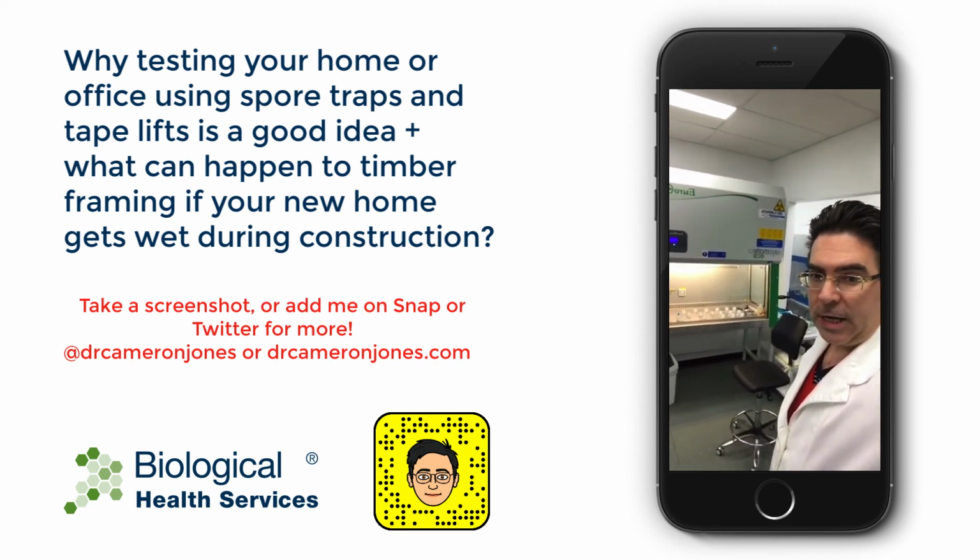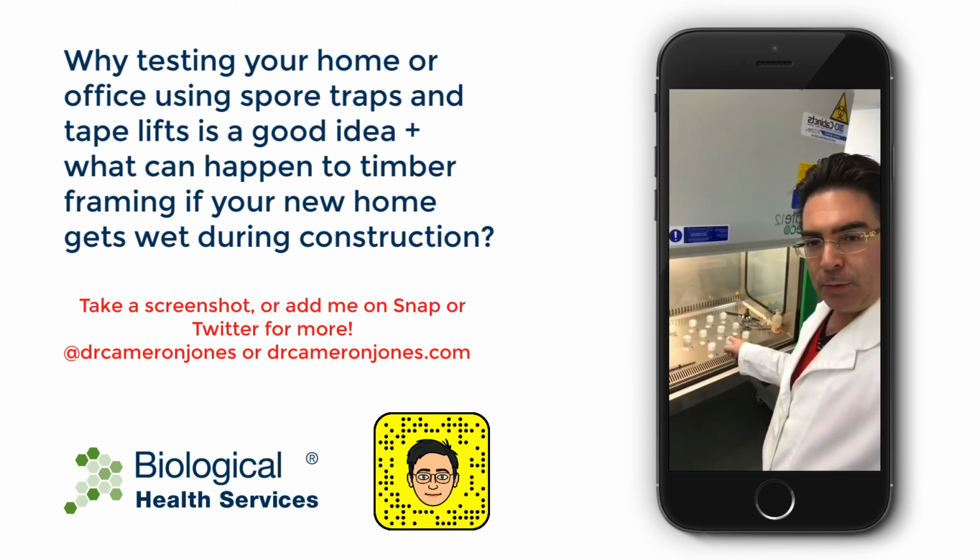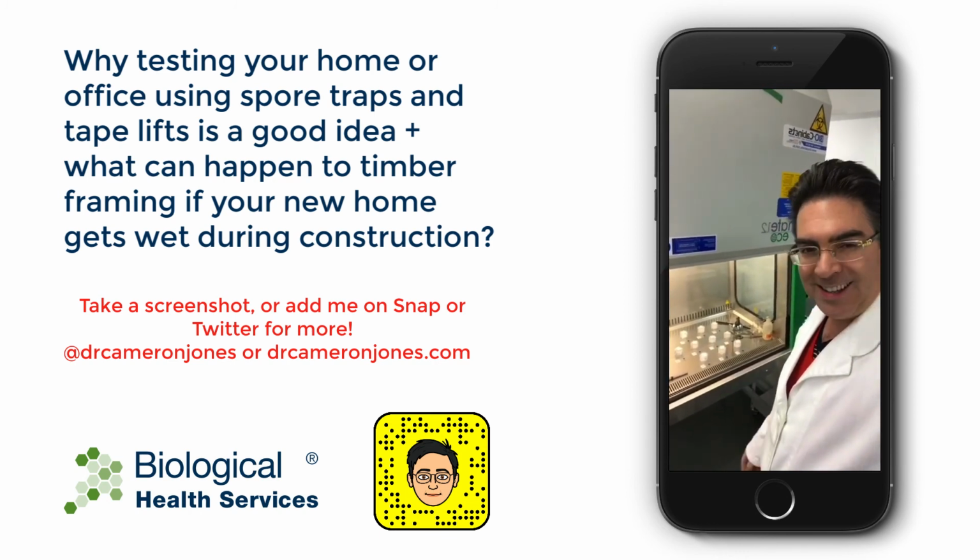Good morning on Thursday the 15th of June. I'll just take you over to the biohazard hood. These are spore traps which determine mould content in people's homes.